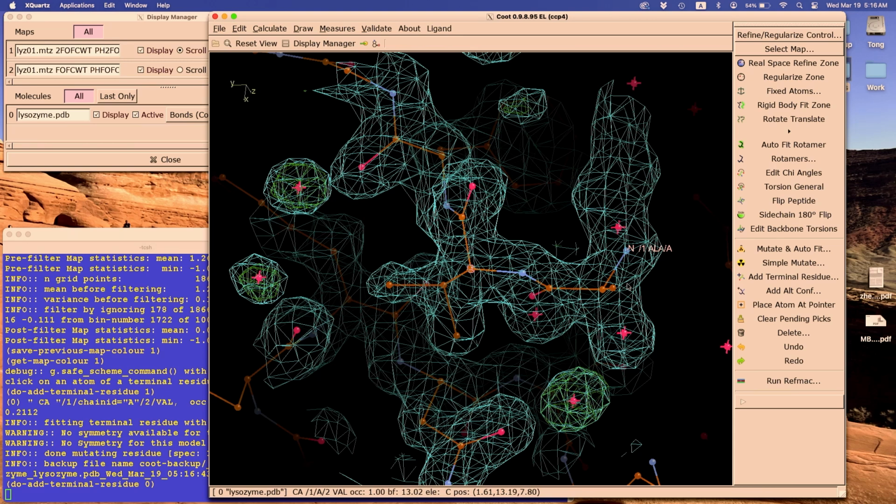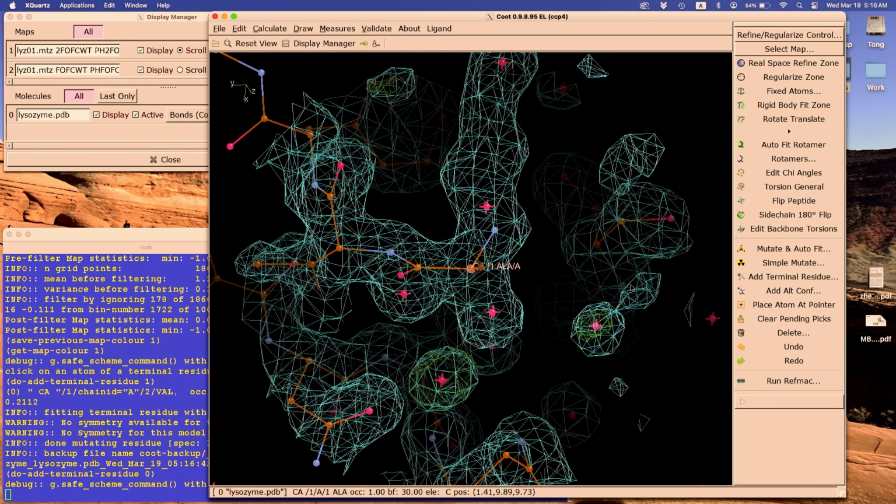And then you can do shift space bar. That goes back one residue. So then it goes back to the residue we just built, which is alanine 1. Please speak up if you are falling behind. Okay. Are we still okay? All right.